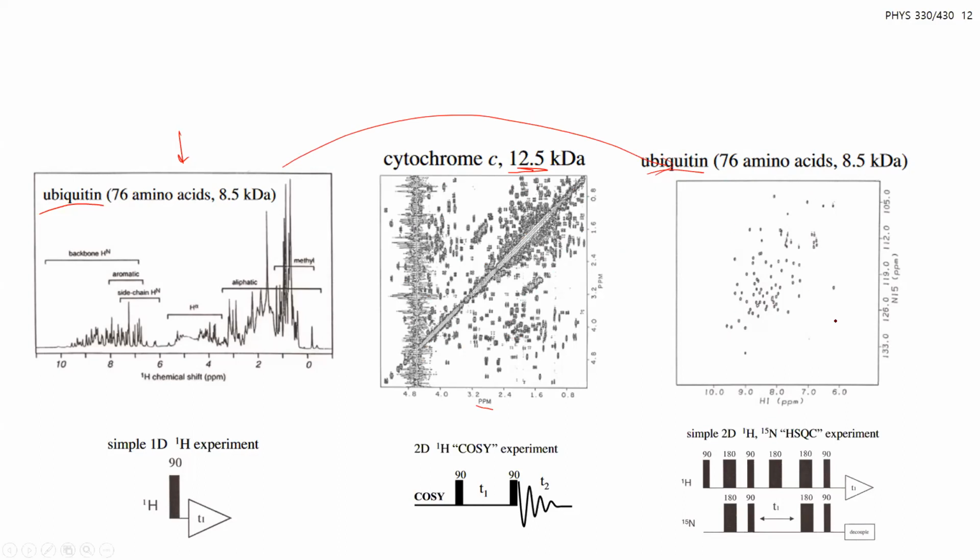If you have a small structural change, it'll be very clear if these peaks shift in a certain direction or disappear. And with those pulsed sequences and the echo arrangements, this is also being shown with the time sequences down here of how you're measuring with different pulses for Fourier transforms, looking at the proton and nitrogen signals with certain delays between them.